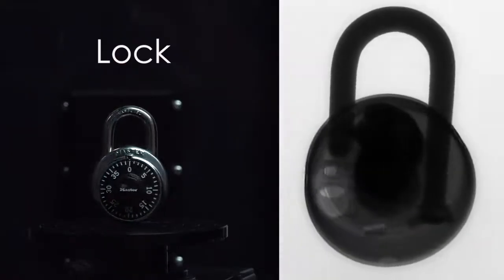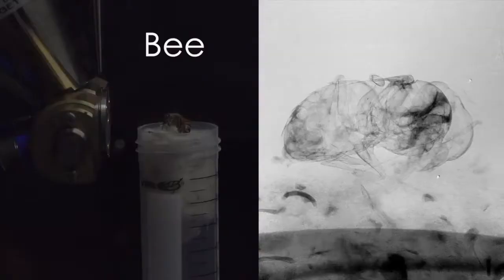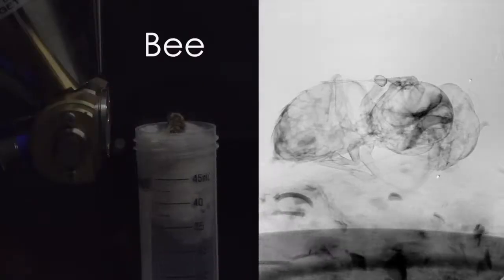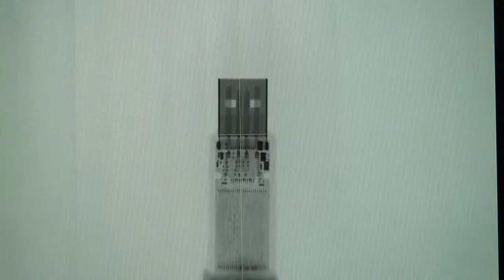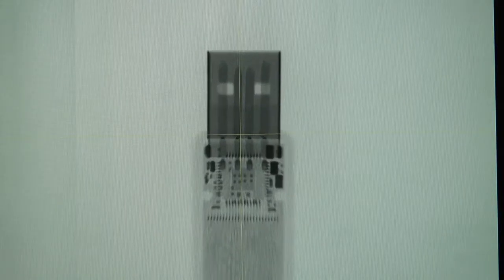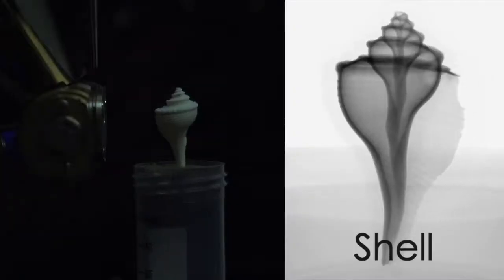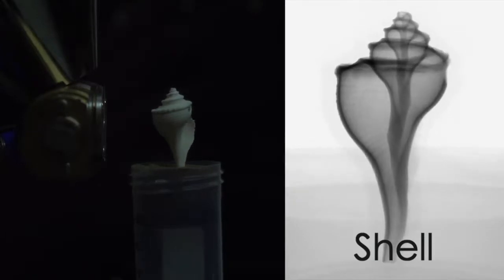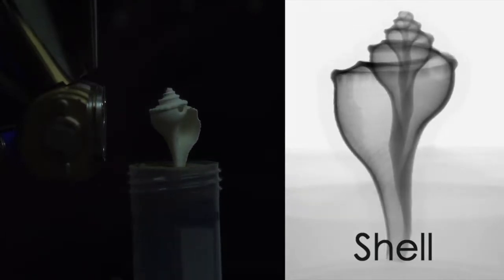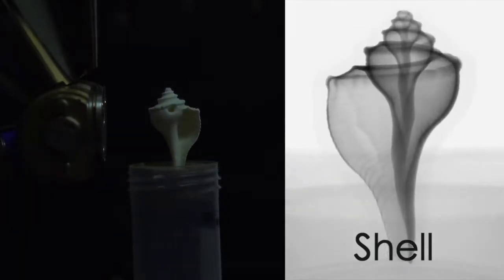Because the stage spins, everything needs to be carefully positioned in order to stay in the field of view. A sample positioned close to the origin of the x-rays will have a better image resolution. 3 to 5 microns is the maximum resolution possible by our MicroCT. Smaller samples allow for scans of much higher resolution as they are able to be positioned closer to the target.